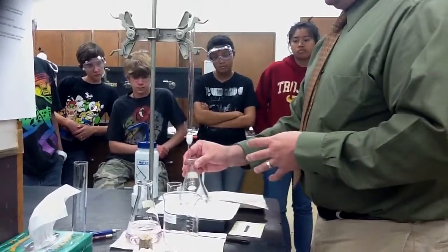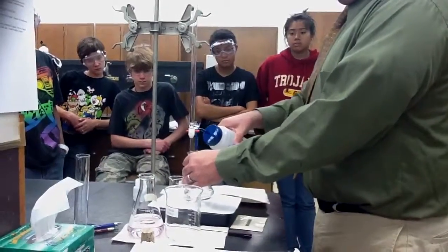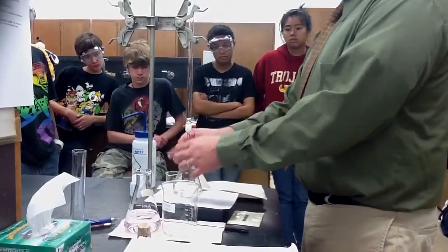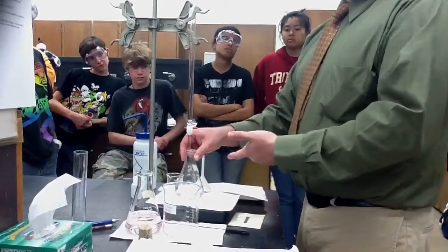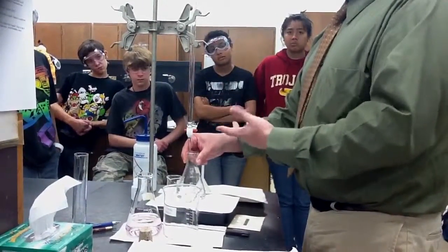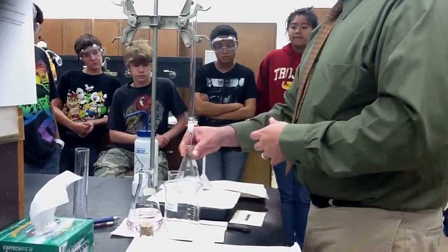So what I'm going to do is simply touch the side of the glass, and then take my squirt bottle and just rinse it. I want to make sure it falls in there, because like I said, that's part of the volume at the end of the count, and that has to react with this. Okay? Because if I let it go more drops, it can really throw you over into the dark pink region.